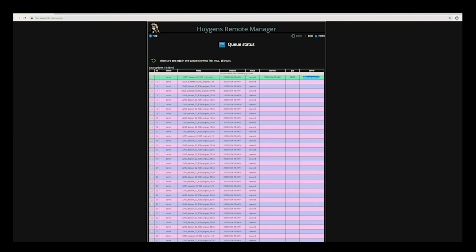It's not the machine where this web service is executed, but it's a different machine. It's a machine that is of course connected to the web server, but it's a different one. And the number next to the name also indicates the GPU ID, so the identifier of the graphic card where the processing is being done.